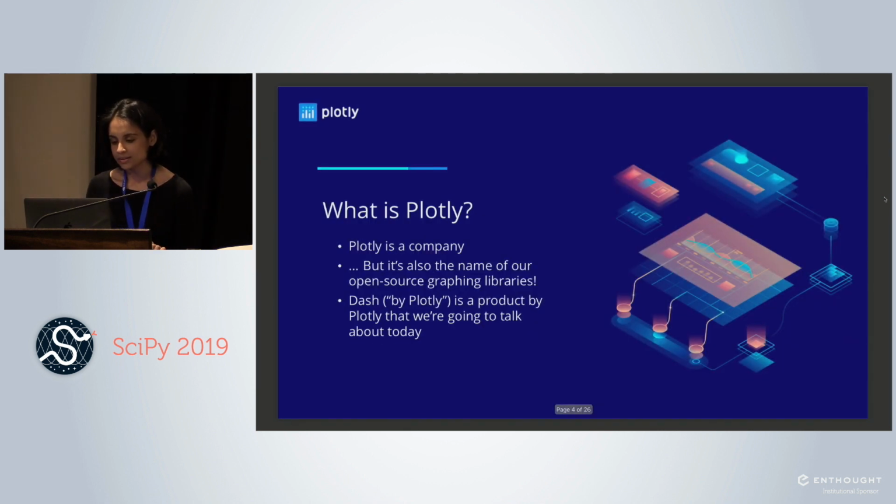So Dash Bio is a Plotly product, but what is Plotly? So some of you might have heard of us. Like I said in my first question, we have a really popular graphing library, plotly.py. But this is only one part of Plotly, the company. So Plotly as a company offers another product called Dash, which is super important, and that forms the entire context of what we're going to be talking about today.